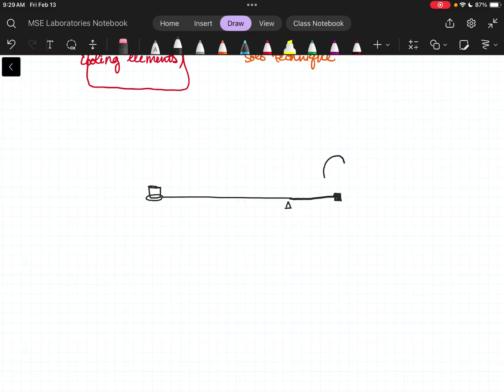So we have the setup that you were talking about, where we go sideways. So we've got these long beam arms with sort of a flat, you could call it a plate, on the end. And the beam has a fulcrum, and then there's a little weight back here.